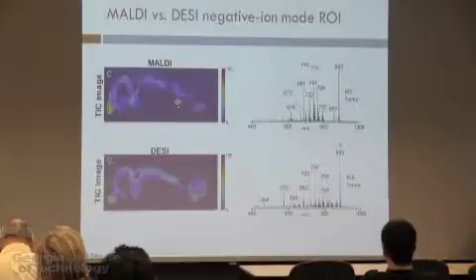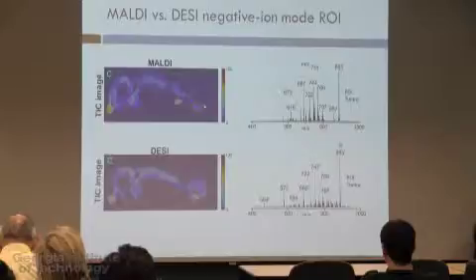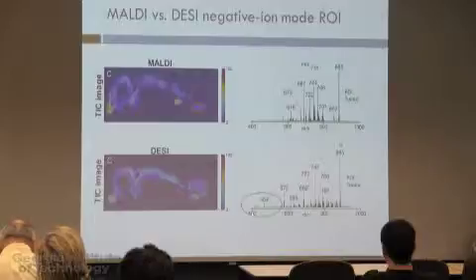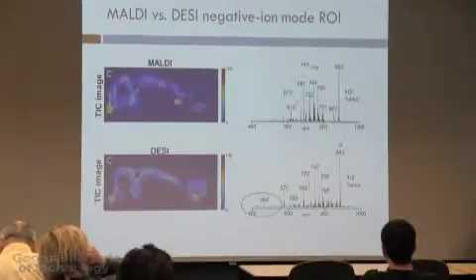I told you that we use two techniques, and they're really complementary. So this is a MALDI image that we obtained with Cameron Sollards in the IBB facility, and this is a DESI image. And you see some obvious differences. Look at the tumor region here and the tumor region in the DESI image. They're really different. There are some other differences too. For example, if you look at the low mass range, the DESI data is much better there, where MALDI tends to have a lot of noise because of the matrix in that range. So you see ions here that you don't see with MALDI. So we use both kinds of data, which makes things a little bit more difficult but more complementary.